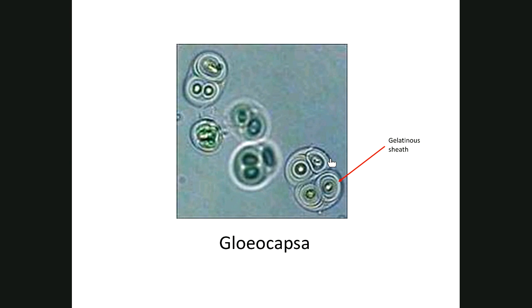What you're seeing here is basically almost like a colonial situation, although there is no contact between the cells. You have four separate cells, united by a gelatinous sheath.